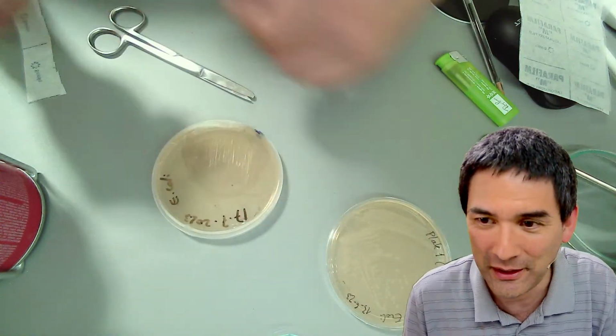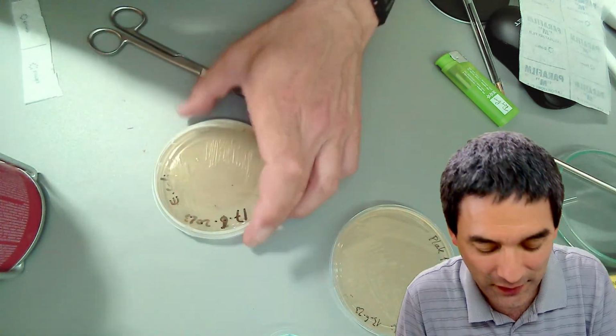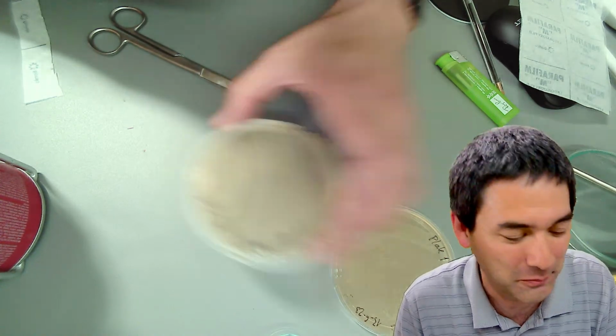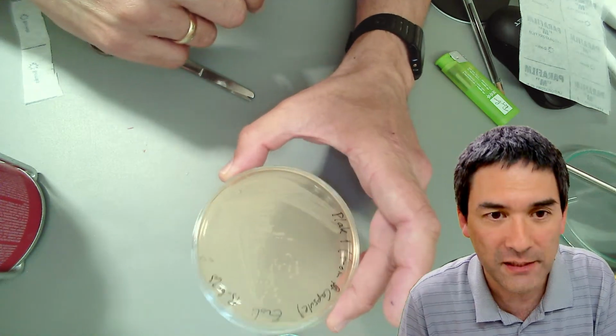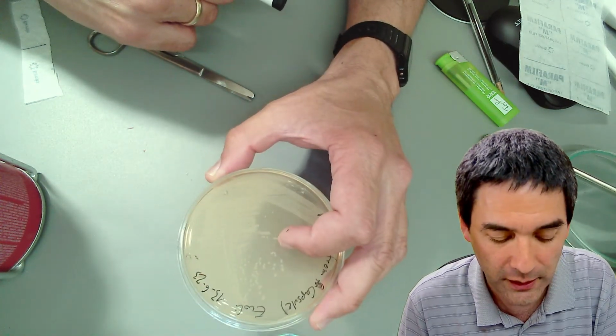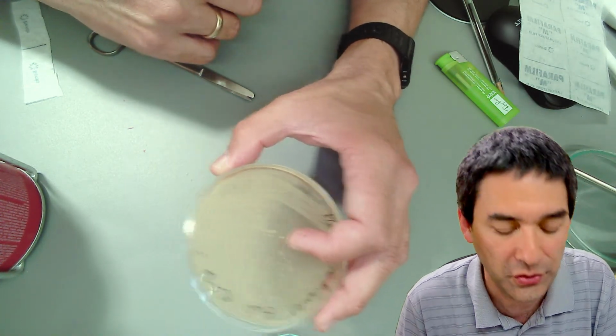That's correct, somebody reminded me. I'm 1 month off, of course. So what's the point of properly labeling a plate if you put on the wrong date? 17th of June. Yes. So that's basically how it will look in 2 days. 2 days later, and now we can do with this whatever we want to do.